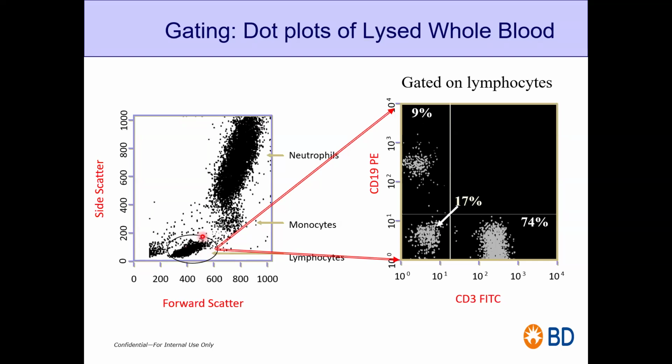Then once you region it, after that you do the gating. Gating means you already regioned that population, and now in that population, you are searching for other things. Let's say we are doing a treasure hunt, and you know that in a particular area you are going to find all your clues. So you made a boundary that you are going to search in this area only.